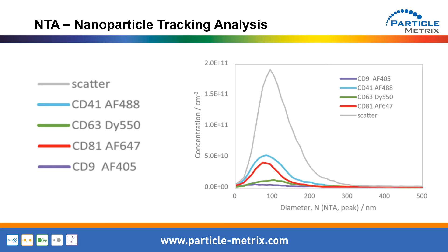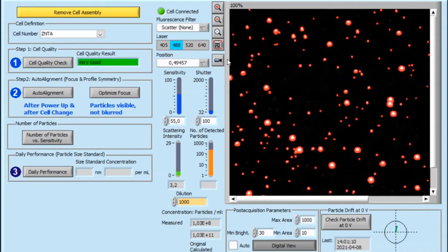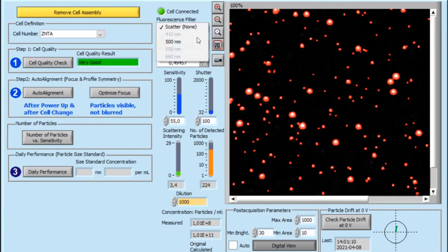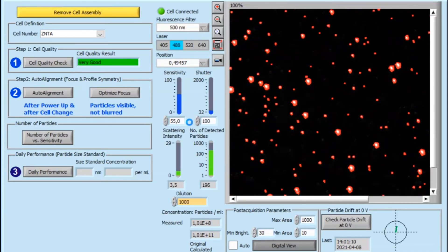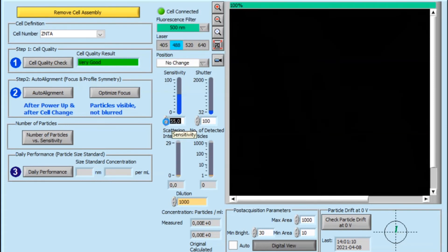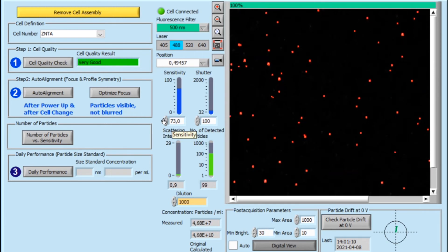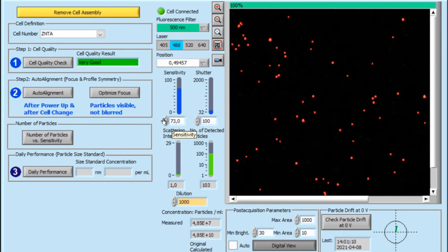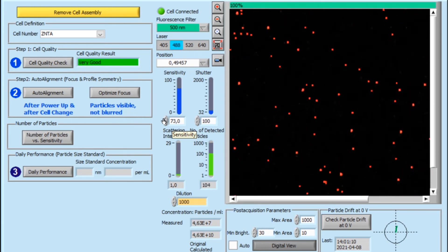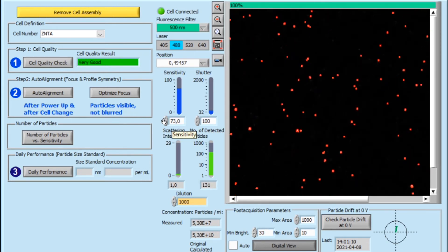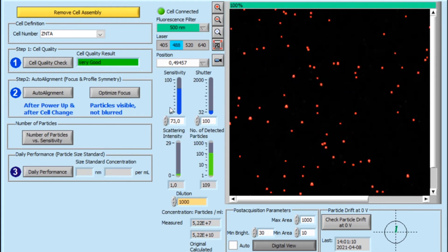After injection of the sample into the ZetaVue, we can see all our particles in scatter mode. By one click in the software, we can switch to fluorescence mode. After increasing the sensitivity, we visualize all particles stained with the CD41 Alexa Fluor 488 antibody, because we are using the blue laser with a fitting fluorescent filter.